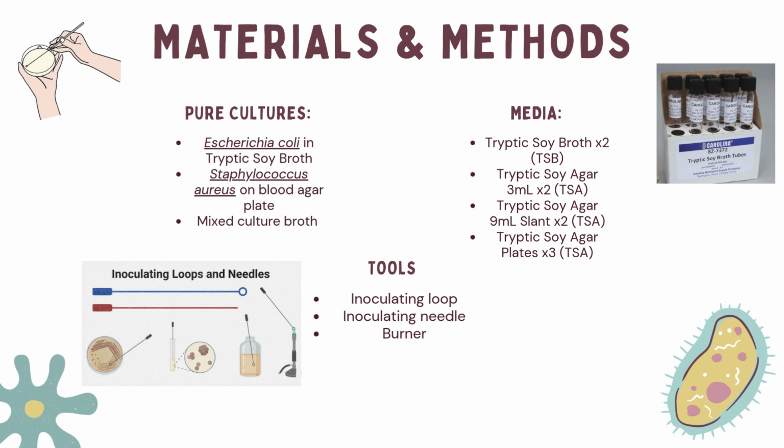Inoculation differed. Broth required simple transfer with the loop. Slants were streaked on the surface. Deeps required a stab with the needle, and plates required streaking for isolation. Some precautions were working near the burner flame to reduce airborne contaminants, flaming tube mouths, sterilizing tools before and after use, and keeping the lids closed when not in use.